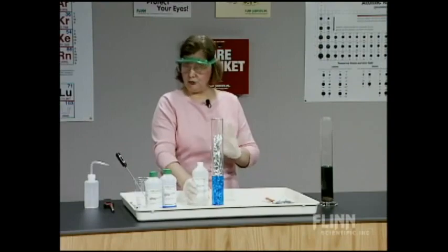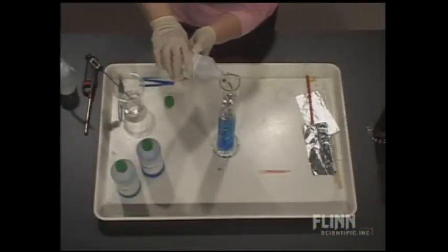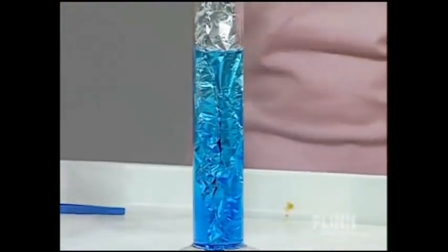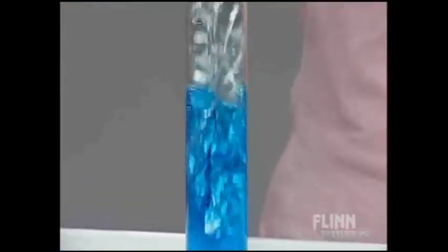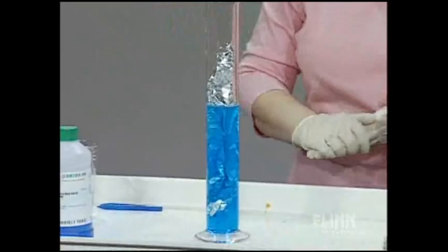But the drawback is that it's a little difficult to mix reagents once you've got them in there. So I'm going to go ahead and add that. And right now I probably still have 2 layers. I'm going to pull that up, but now our aluminum foil is a very convenient stirring rod. And so what I'm doing here is mixing the copper 2 sulfate and the sodium chloride.